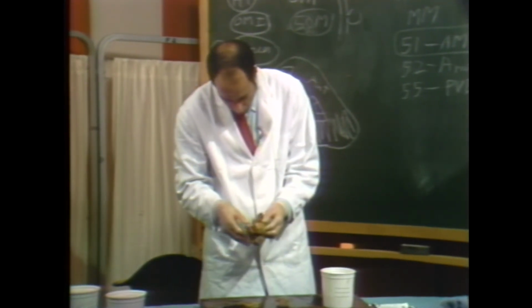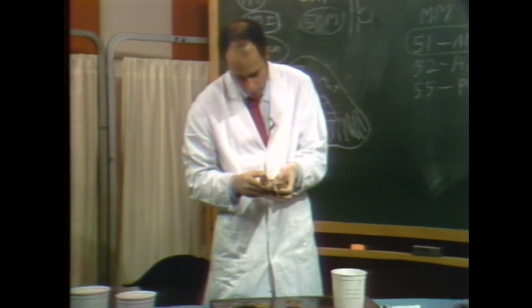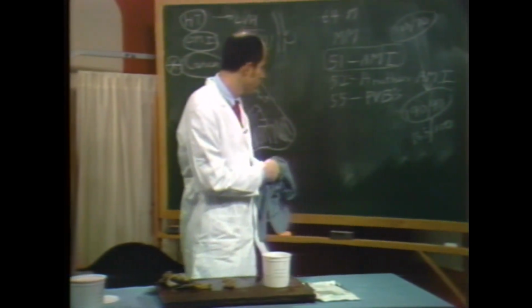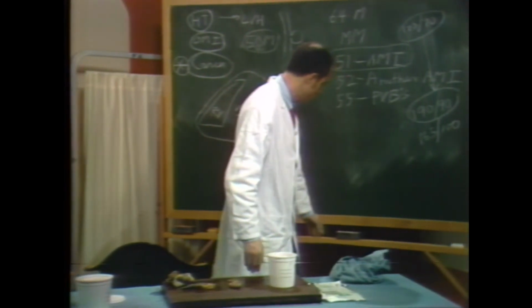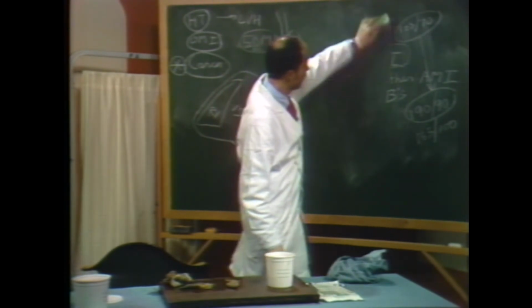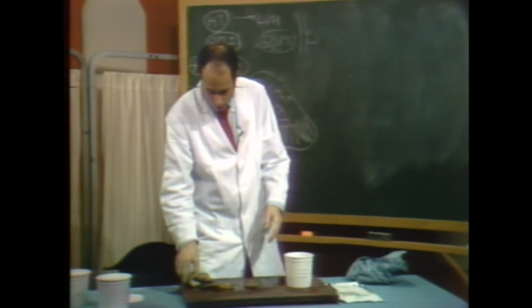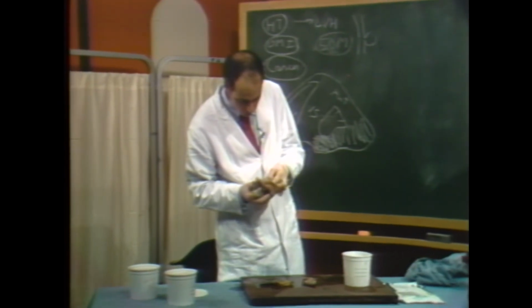Well, I'd say this is an elderly individual. I'd say 75. And that he may well have presented with complete heart block or left bundle branch block at any rate. Can't be positive looking at that, but that certainly may be the situation. I don't see anything in his heart, quickly looking at it here, that would be an explanation of his being examined right here.